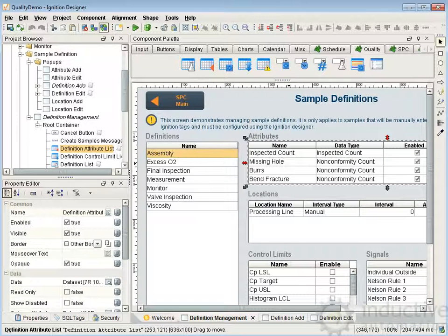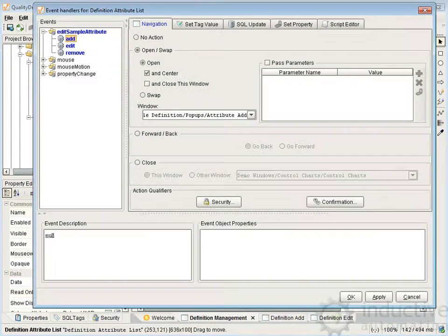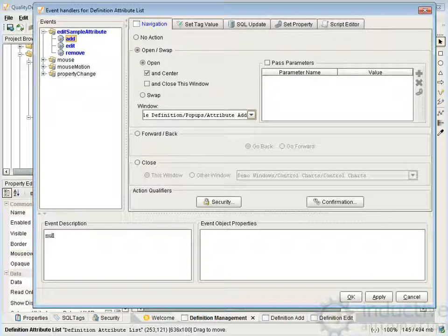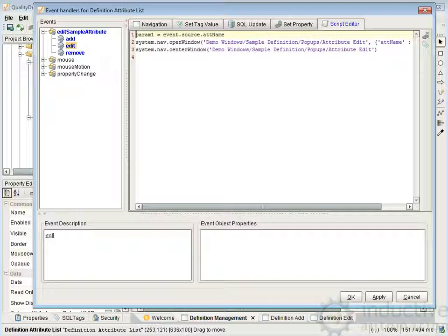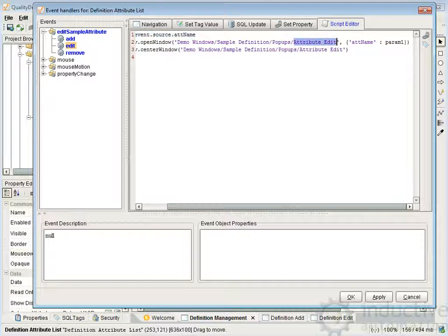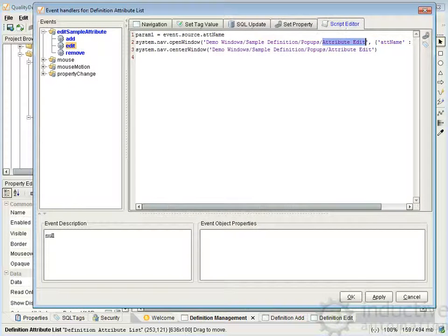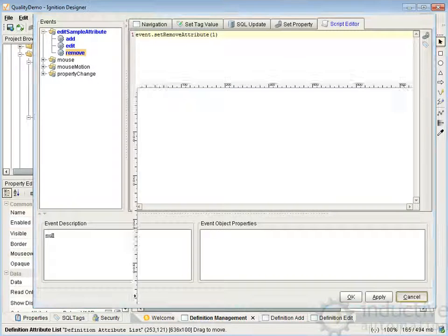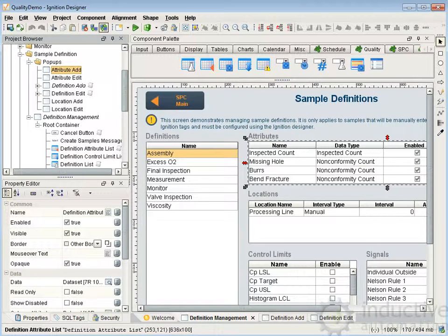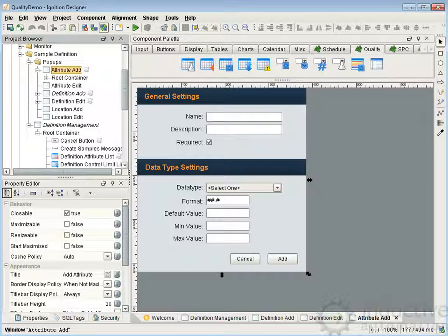Going back to our definition management, if we take a look at attributes, we have the same thing: right-click events, we have add, edit, and remove. Again, we're just pulling up a screen — the attribute add. One slight difference is we're going to pass the attribute name over to the attribute edit screen so it knows which attribute we selected. The remove works the same way: event.setRemoveAttribute, the same way as the definition was removed.